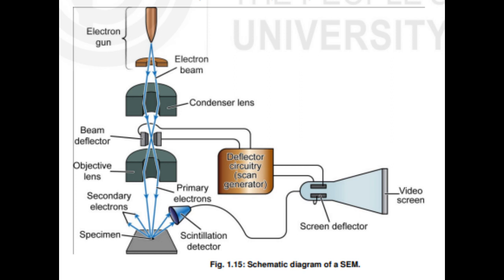The SEM image depends upon the surface processes. SEM can produce images of bulk samples up to many centimeters in size. It produces images of the three-dimensional shape of the sample, Fig. 1.15. This microscope has proved very useful in studying the minute structural details of the cell surface, Fig. 1.16.